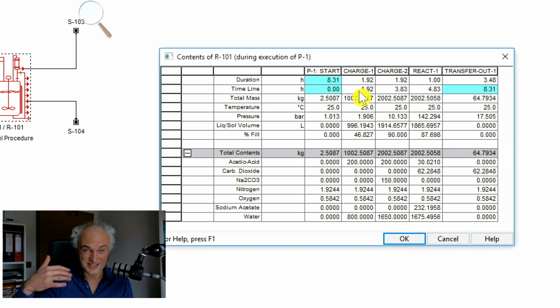It's often forgotten that pumping takes time in real reactions or in real production scale equipment. It's not just like pouring it in and everything is fine. You need to pump in 1 ton of water. That takes time. Then you see this is the total mass which is in our bioreactor. At the beginning, it's just air, but then, of course, in our reactor, things go up.